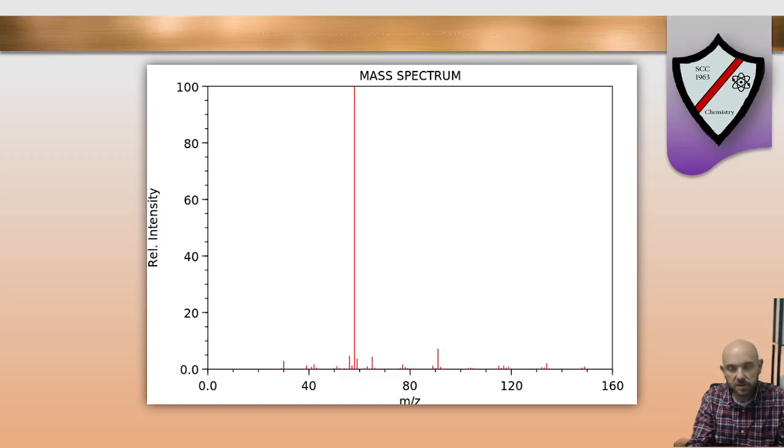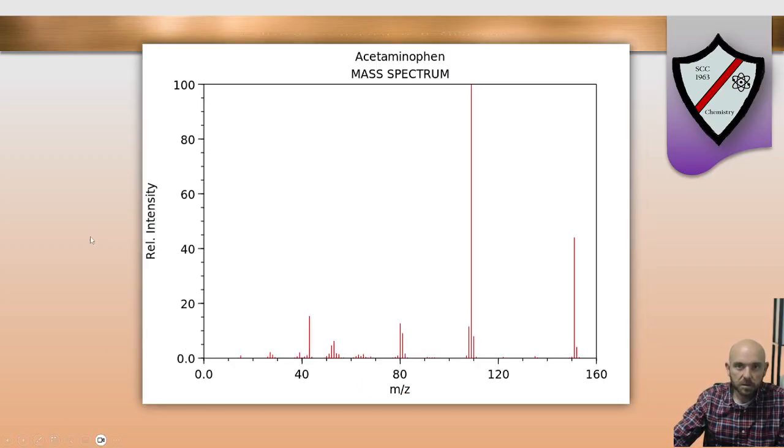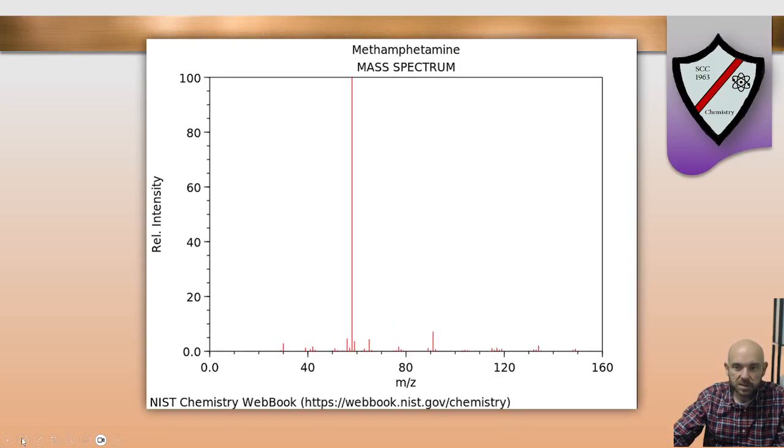For example, as you might see on your favorite forensic show, we put this unknown molecule in that seemed to kill somebody, and we compare it against our suspected culprits: acetaminophen, so regular Tylenol, and that doesn't seem like that good of a match. Or methamphetamine could be what we found at the scene as well. That seems really pretty close. And notice we also see the 149 matching molecular ion peak down there.